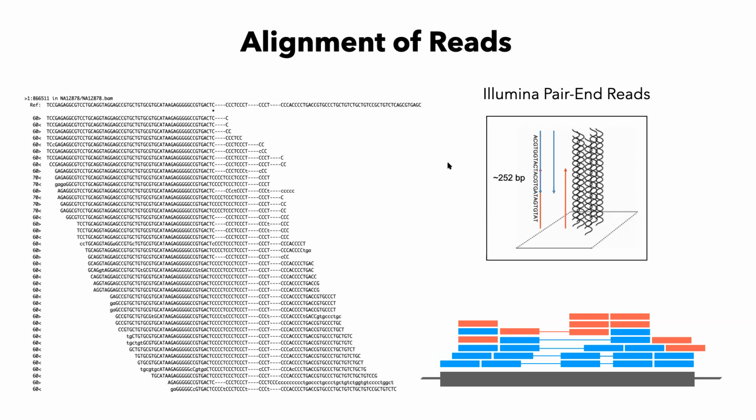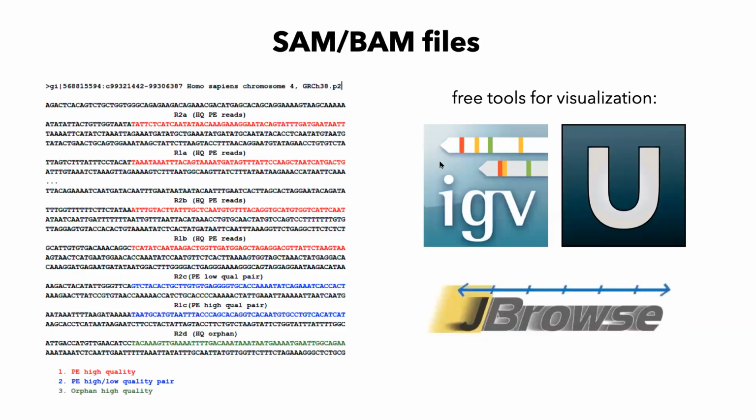So to illustrate how this actually works, we have to look at an example. How does this look when we align the reads? So to show you how those look, I'm going to ask Harpreet to show us an example of a demo pipeline with an assembly, with how those reads map onto the reference genome. Thank you, Ilya.